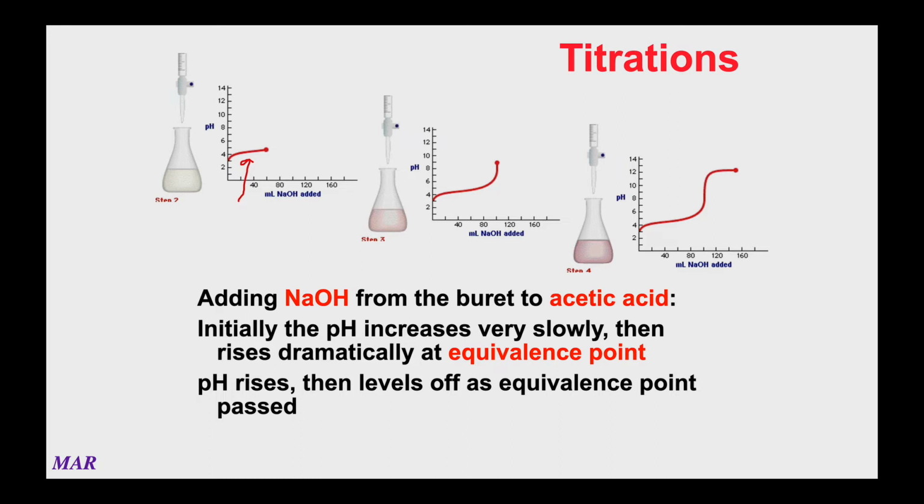However, once you get through this region, then in the second graph, you can see that, man, that titration curve really spikes up really hard. And that spiky point where it's really steep right there, that's really where the equivalence point is, the equivalence point between the acid and the base. And then finally, because we're adding sodium hydroxide to an acid, after a while, when you get past the equivalence point, then you can see you have this really sharp kind of curve part right here.